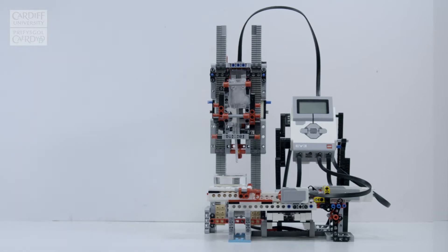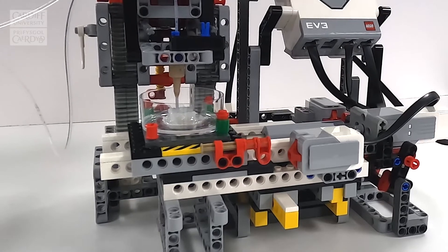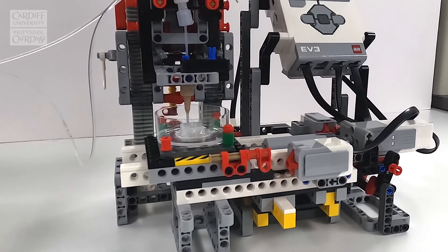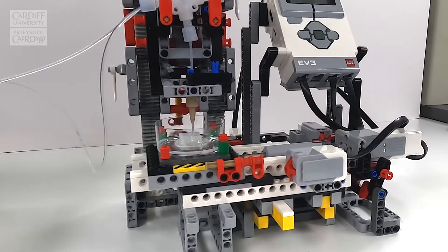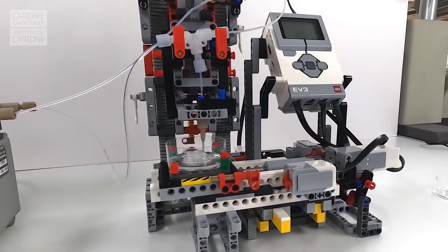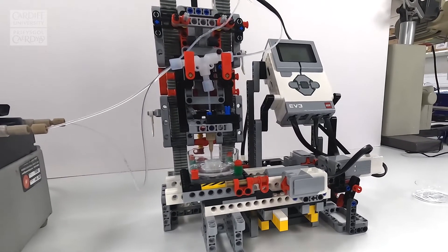Commercial 3D printers cost upwards of tens of thousands of pounds, and our initial idea was to develop a 3D bioprinter that was a lot cheaper and accessible to many research labs, not just ours. The idea came from discussion with a research group that we could use a very accessible material, and that material was Lego.